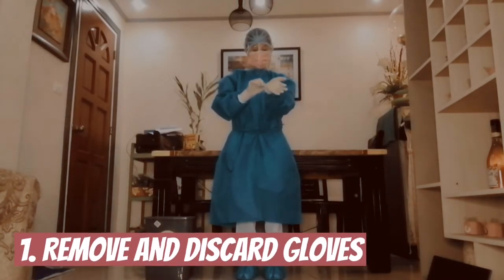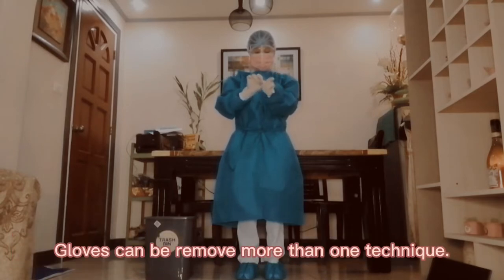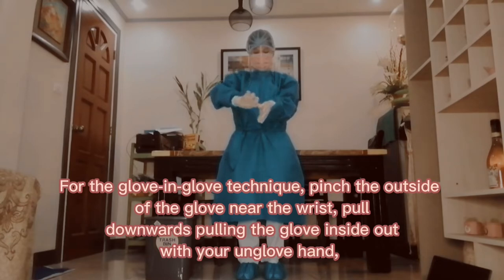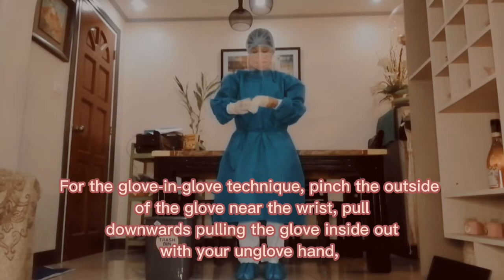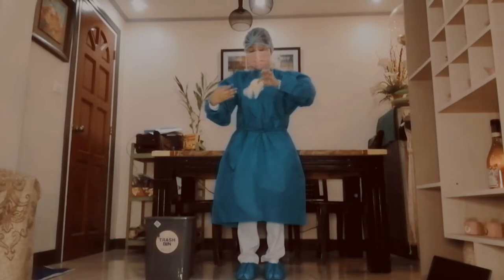First, remove and discard your gloves. Gloves can be removed using more than one technique. For the glove-in-glove technique, pinch the outside of the glove near the wrist. Pull downwards, pulling the glove inside out with your ungloved hand. Slide your finger under the wrist of your remaining glove.